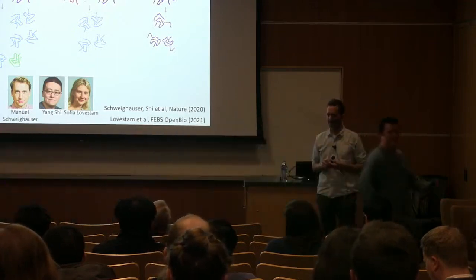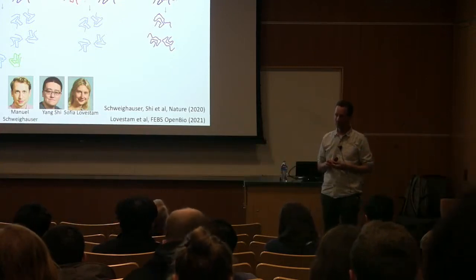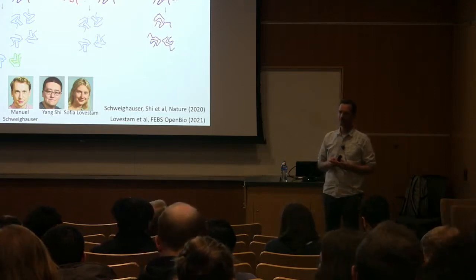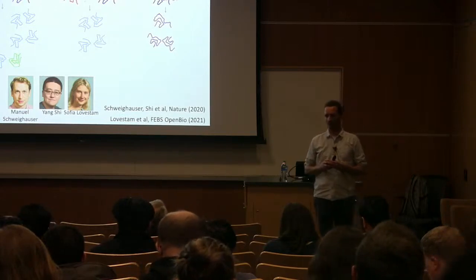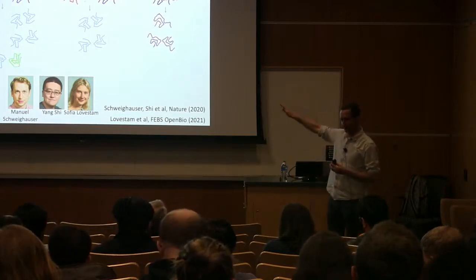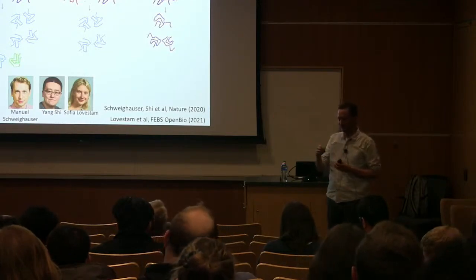I was interested in this heparin-catalyzed filament formation in vitro. So does the heparin also get required in the presence of the different salts? Are those still heparin-catalyzed in the in vitro system? Oh, so all of the structures Sophia did, there was no heparin. No heparin, because if you add heparin it's beautiful.